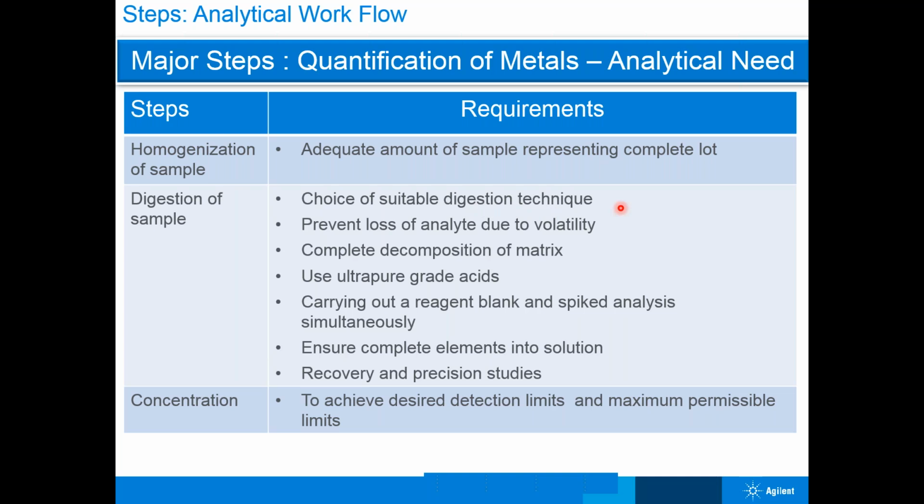When we talk about the microwave digestion technique or any digestion technique, the main purpose is the complete decomposition of the matrix. I will take a small example: suppose I take a fruit, and in the fruit I want to estimate the elements. My interest is the inorganic part of that fruit. I'm not interested in the organic part.